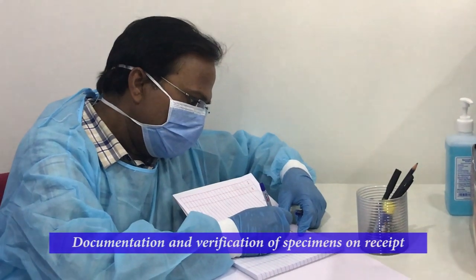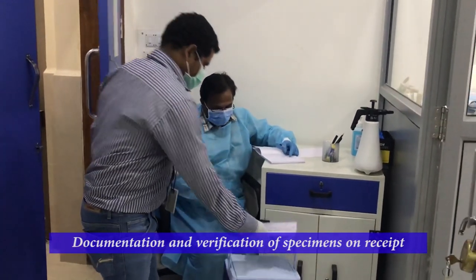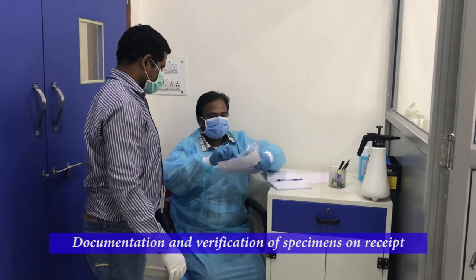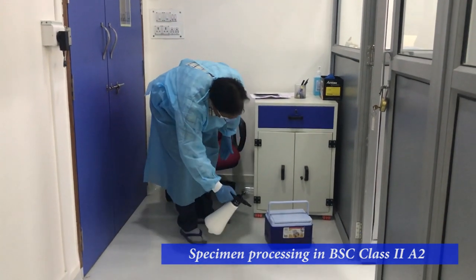In the clinical specimen handling laboratory, the specimen container along with the case sheets will be handed to the lab personnel. The names will be registered in a register. Sample ID number will be allotted to the samples and then given to the lab team separating the specimens.